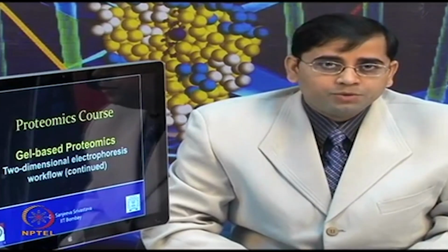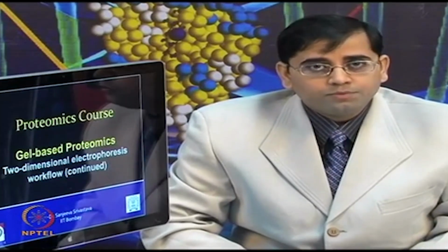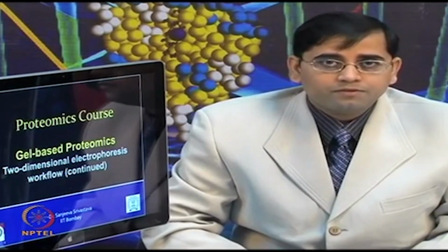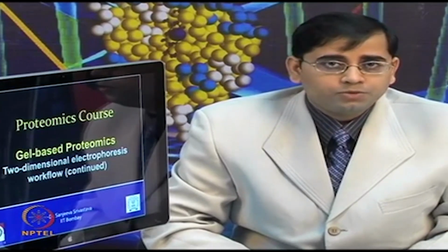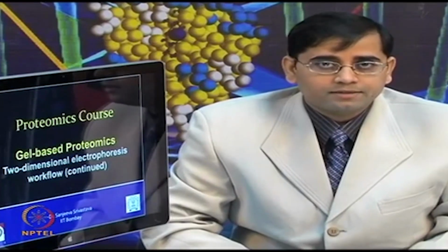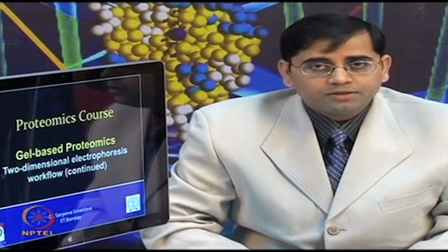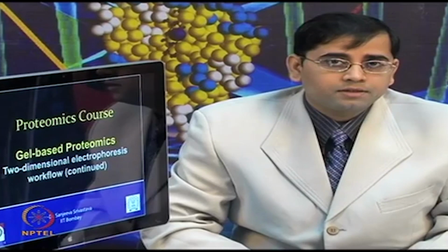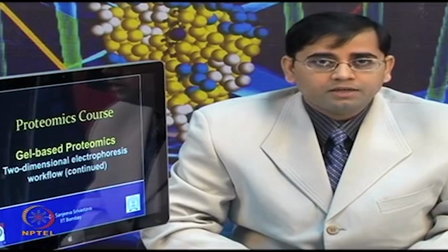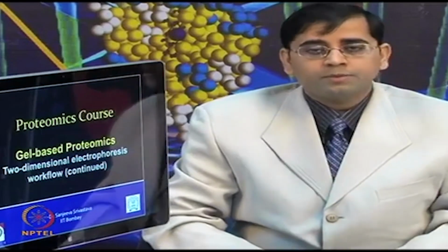In the last lecture, I described that to perform a two-dimensional electrophoresis experiment, you need to follow a workflow, and I gave you the different steps involved in performing the 2D. The first step was isoelectric focusing, which means you focus the proteins based on their isoelectric point. I demonstrated some video to give you the laboratory feel of how the experiment can be performed, and now we are continuing from the previous lecture.